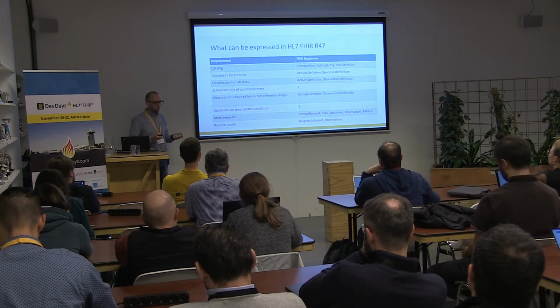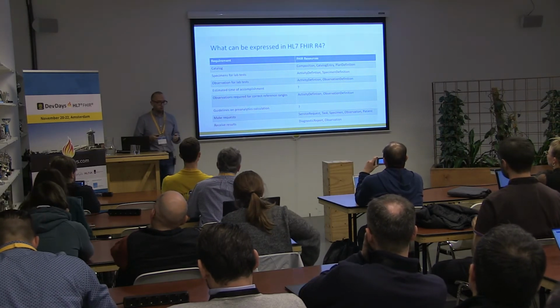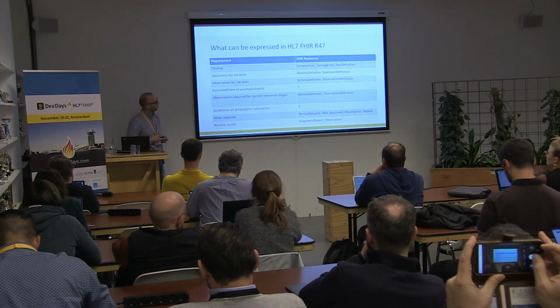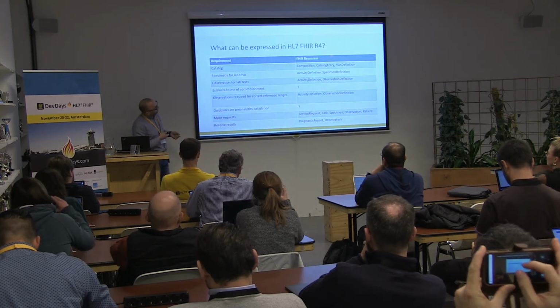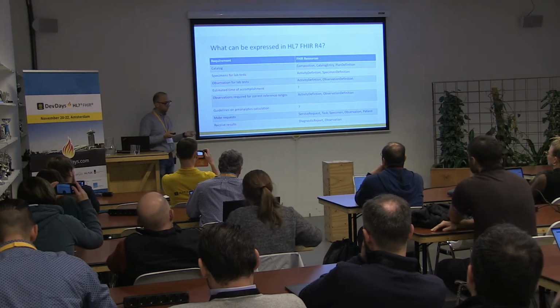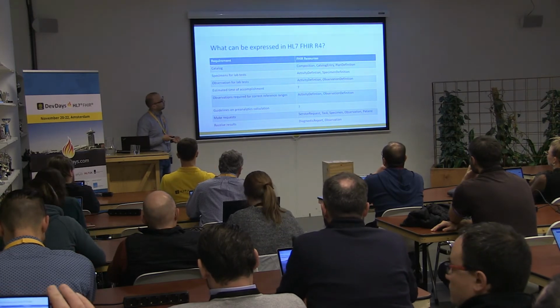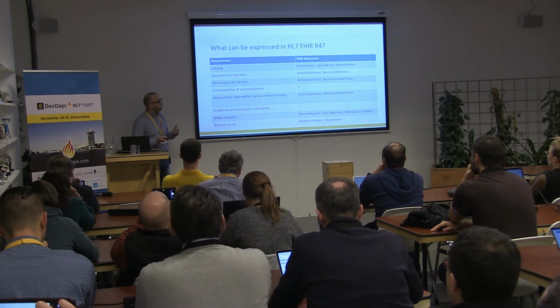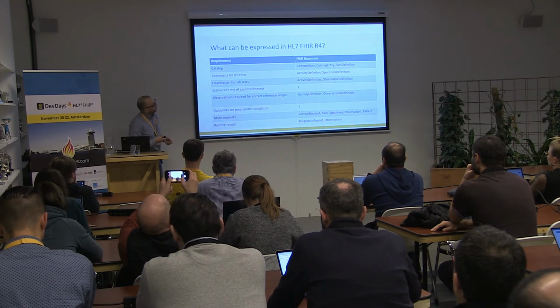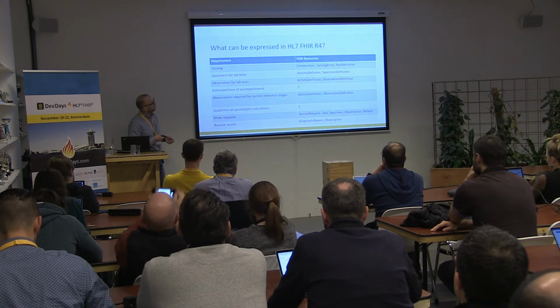Prior to the current version of the standard, all this type of interaction couldn't be expressed in FHIR, or there was no easy way to express such kind of interactions. Now we have a composition, this sole resource, where we put a list of all tests which can be done. Then we have metadata about real tests. How long will they take? Are they orderable, and so on? And then information about tests, information about specimen, information about results.